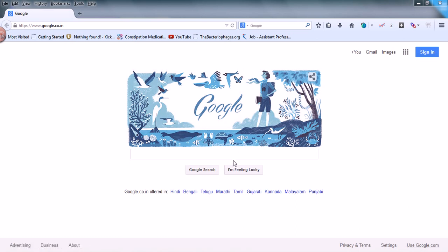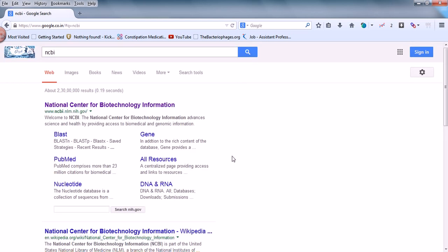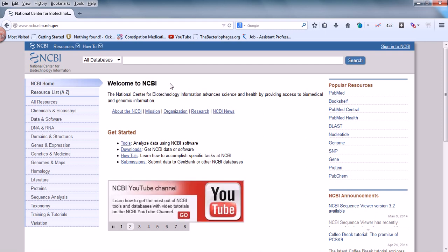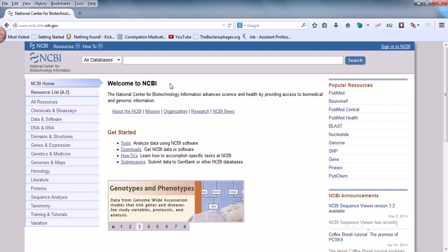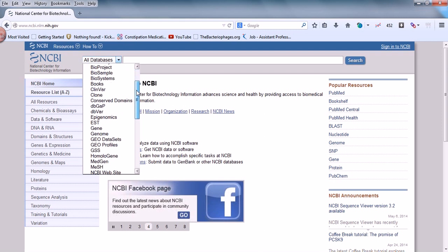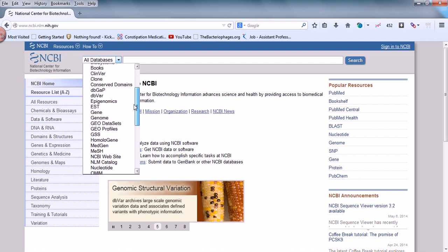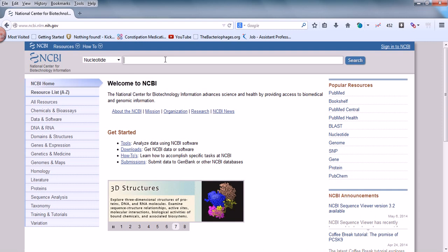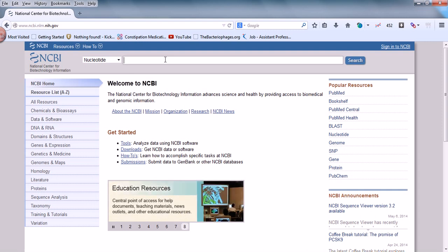To get the DNA sequence of any kind, we'll be looking at NCBI. So let's move on to NCBI. To get the structure of eukaryotes, you need to go to NCBI — the National Center for Biotechnology Information — then from the dropdown select 'Nucleotide'. I'll put in an accession number here that I want to find.